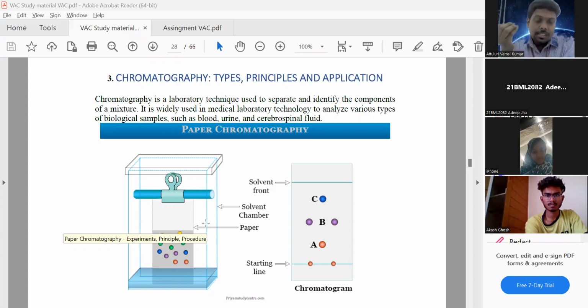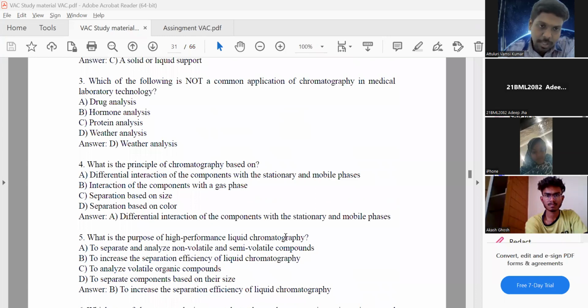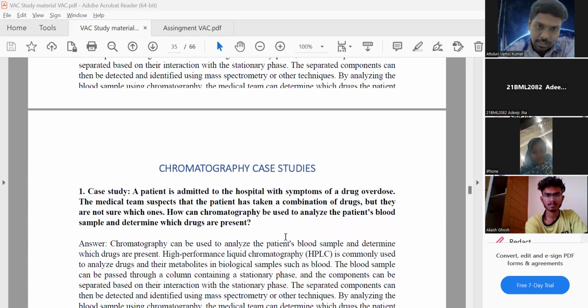All biomolecules have a certain electric charge, which depends upon the type of amino acids the molecules have. We know that amino acids are acidic or basic, and they have some electric charge. Depending upon this electric charge, we can separate molecules, but that cannot be achieved with chromatography. So we need an alternative method that can separate molecules based on electricity, and that is electrophoresis. Electrophoresis can separate molecules depending upon their electric charge also. That is the idea of electrophoresis.